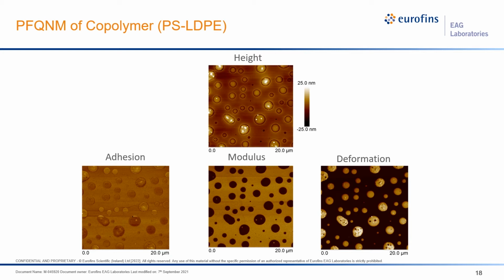There are numerous issues with the mathematical models used for the calculations. The modeling issues are generally related to the actual physics and geometry of the AFM measurement. So for absolute quantification of nanomechanical properties, we generally recommend standalone nanoindentation. Nanoindentation can also provide maps, but at lower lateral resolution. Of course, EAG also has many other techniques to characterize chemical properties of polymers, such as FTIR and TOF-SIMS.